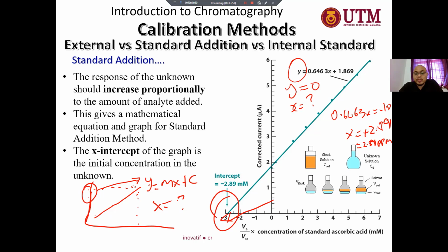But again, for example, in the future you need to perform the standard addition. For example, you get 2.89 ppm from this analysis. But you need to remember, previously we diluted 2 mL of our sample in 10 mL of flask.